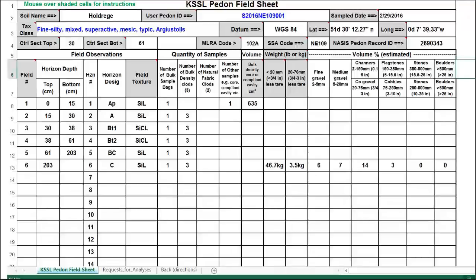Okay, so now, actually the sample information is down in the spreadsheet. It's going to be one line for each layer or horizon. First one, field number, and this is what Phil talked about yesterday. It's the sequential number of samples in the project. We said the project is the group of samples that you submit together.